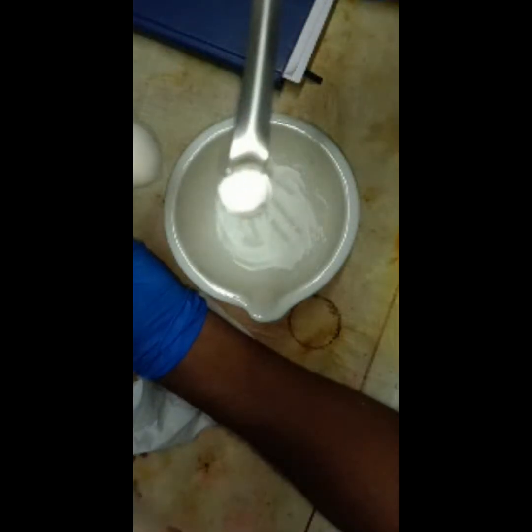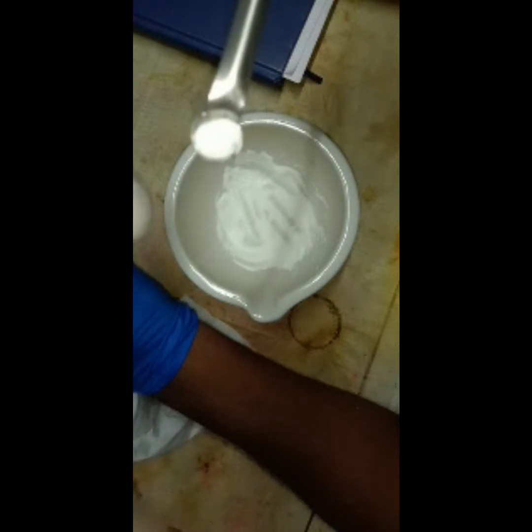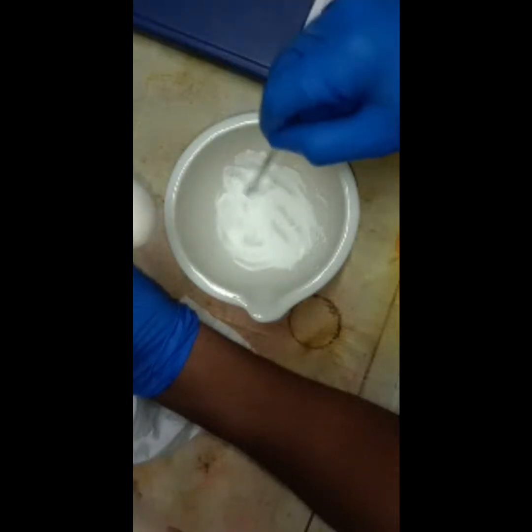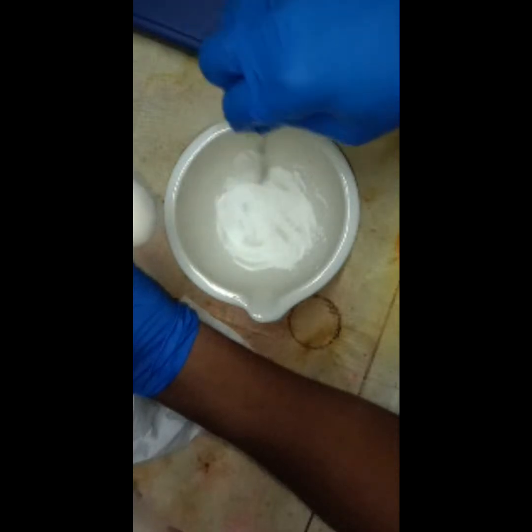If the sample is not ground well, it is not in powder form, but has a little roughness. You can once again gradually grind the sample.